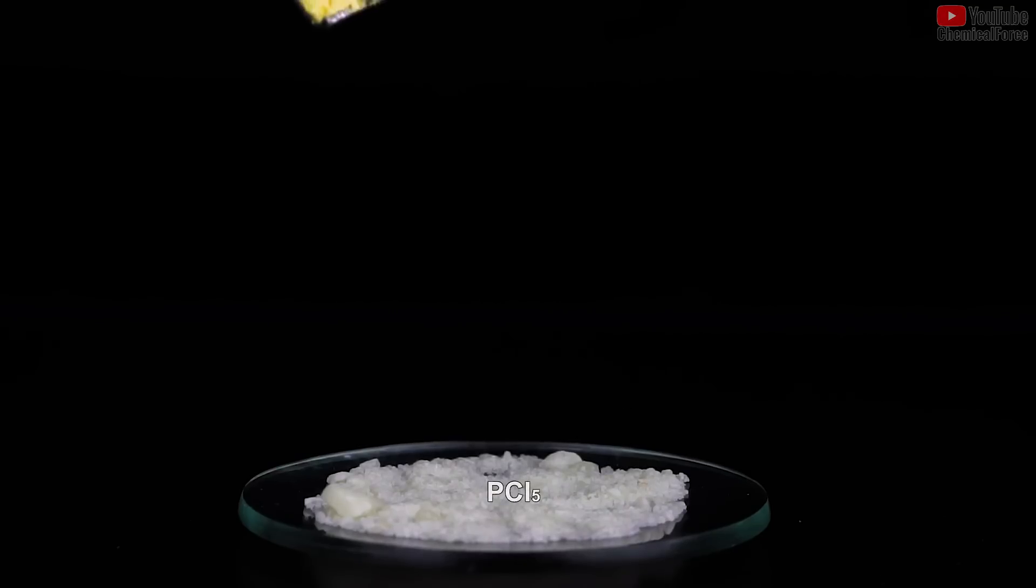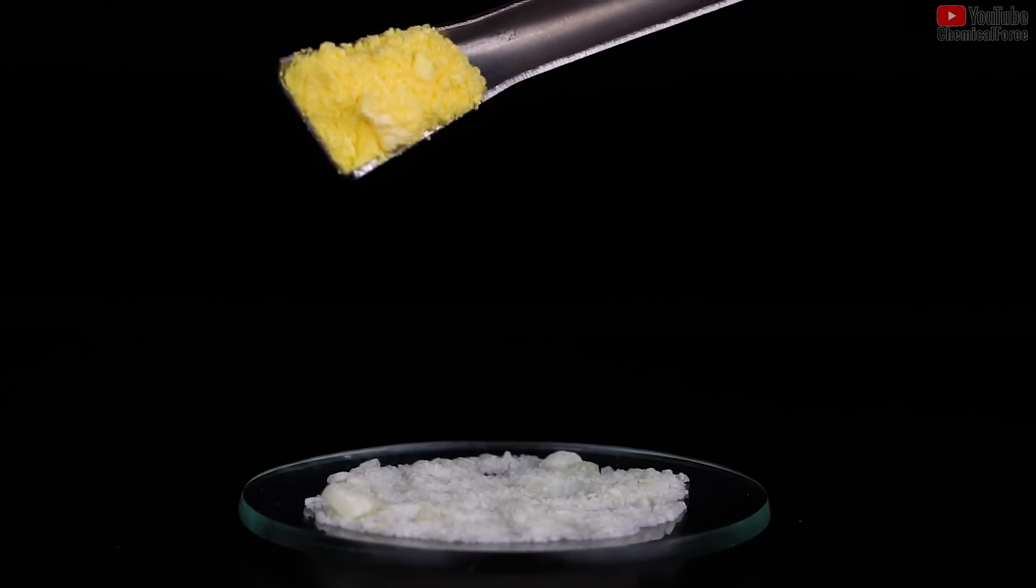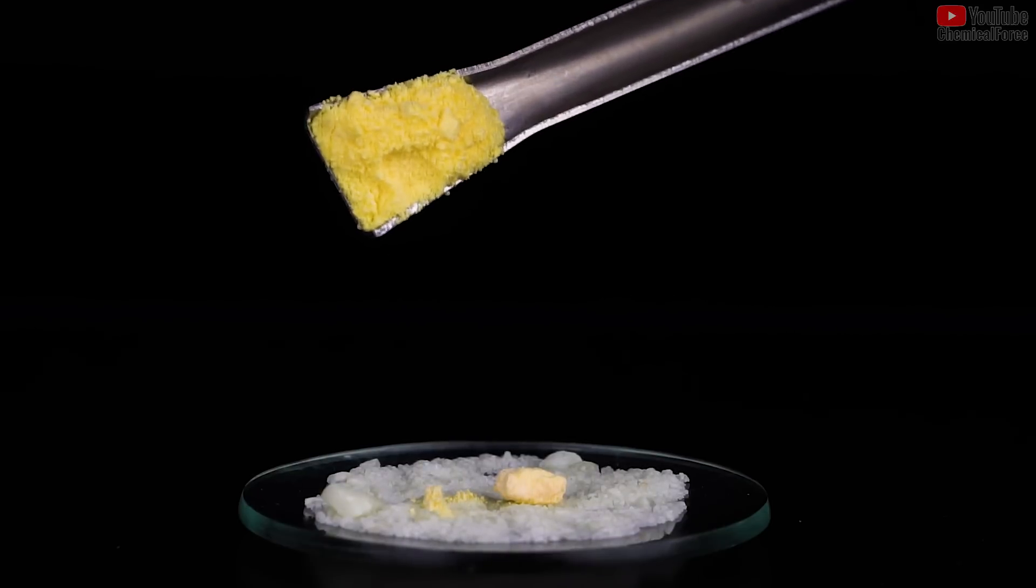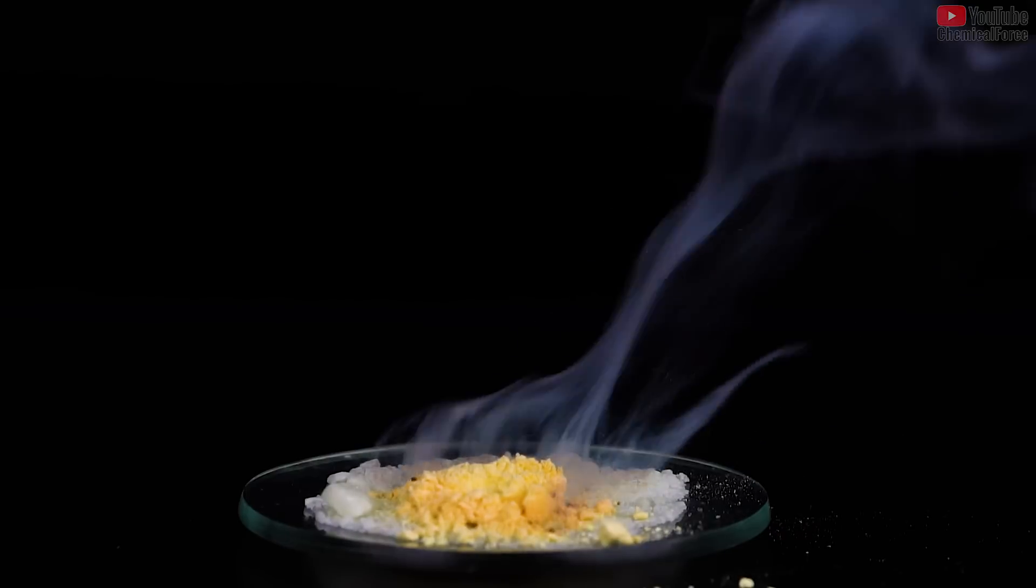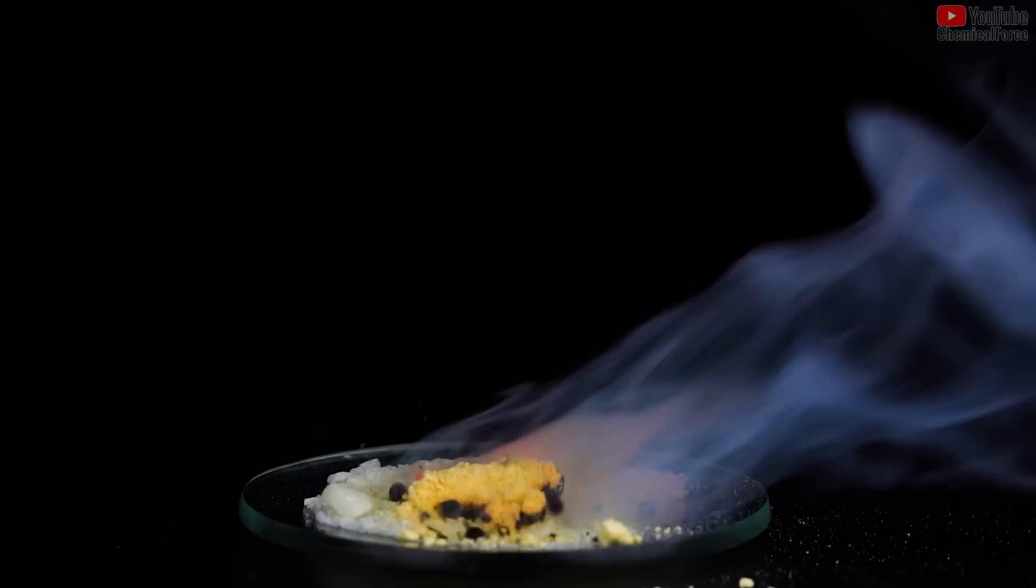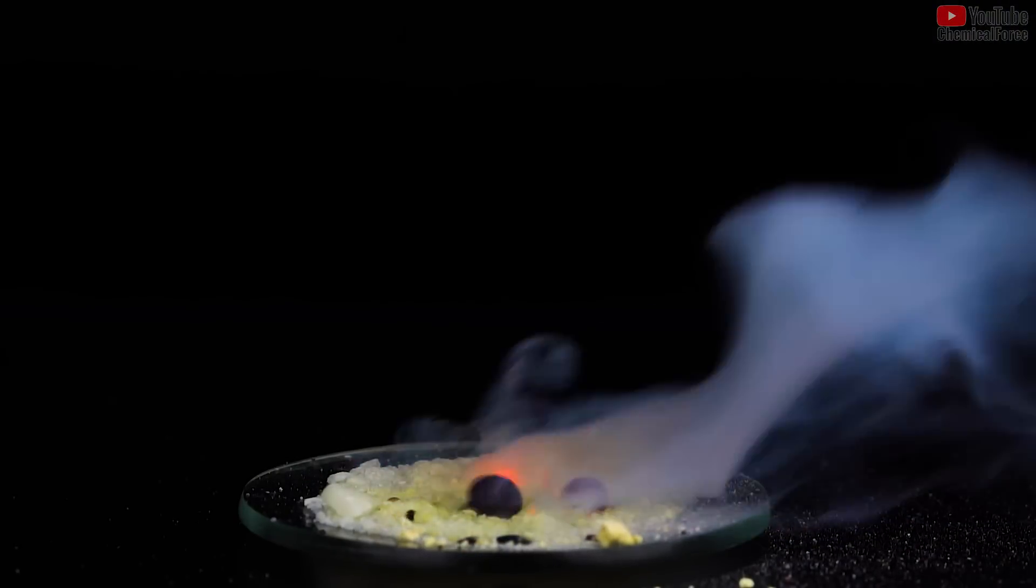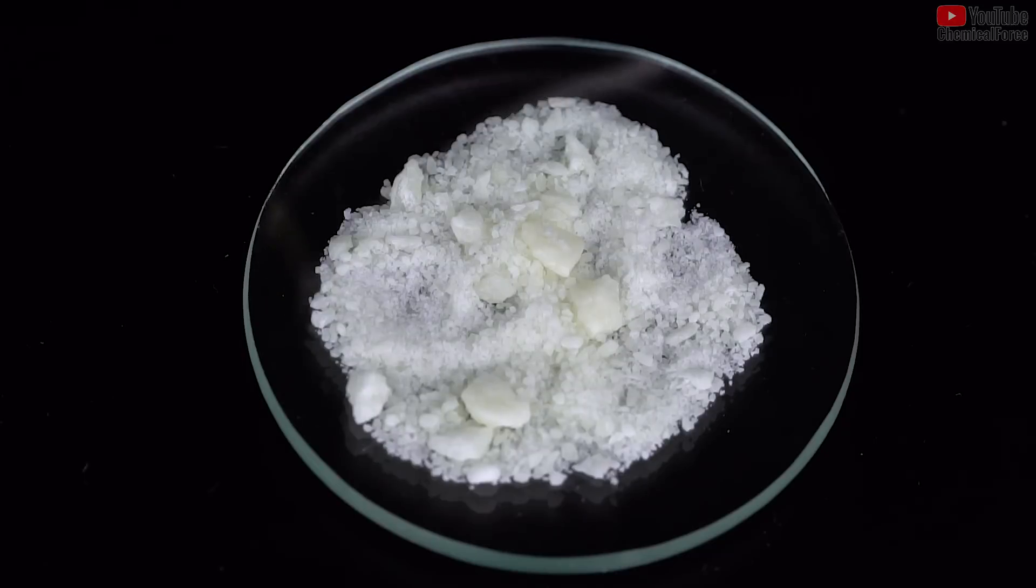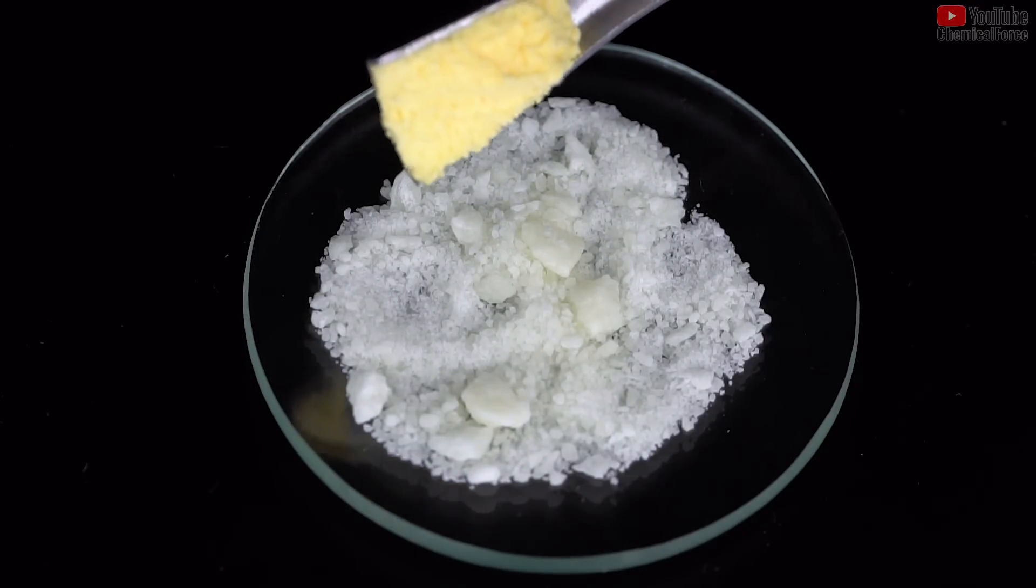I already showed you once a nice interaction of potassium superoxide with phosphorus pentachloride that results in the formation of fire blobs. So let's take a look.